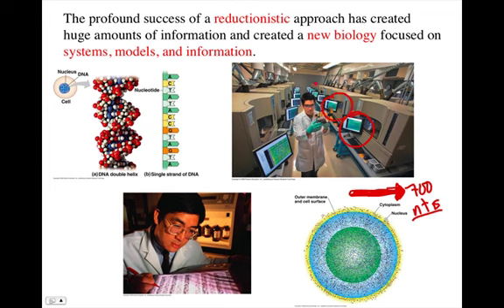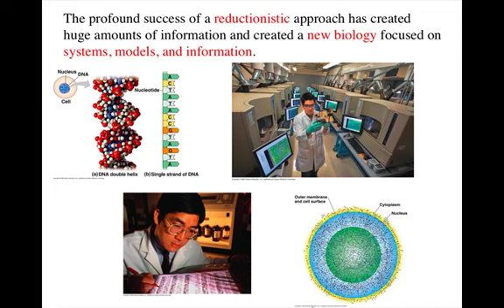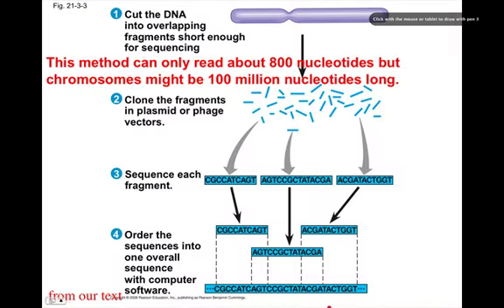And so the last thing to mention about this figure is that scientists have to set up several of these instruments, because each one is collecting a relatively short piece of data that then is used by a supercomputer to find overlaps between what this sequencer read and what another sequencer read, and extend those longer and longer, ultimately getting them up to 100 million nucleotide letters long. So it's an amazing job for supercomputing to line up all of these products.